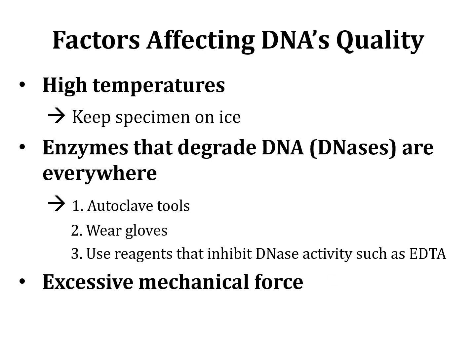Okay, another factor is excessive mechanical force. If, for example, you vortex or you shake the DNA aggressively, this will shear the DNA. This will destroy the DNA. So these are factors that can negatively affect the DNA. Okay, so if you want to get good quality DNA that is good to use for subsequent experiments, then you need to take these into consideration.